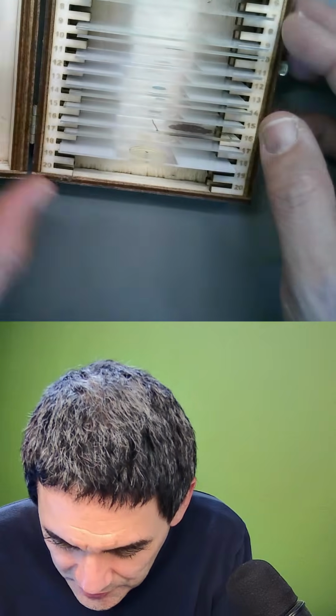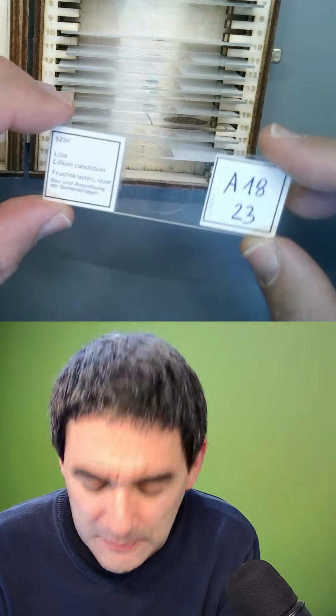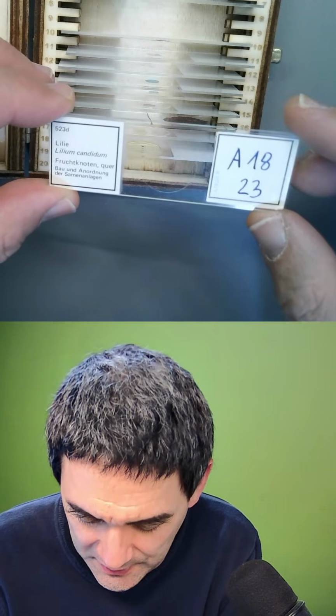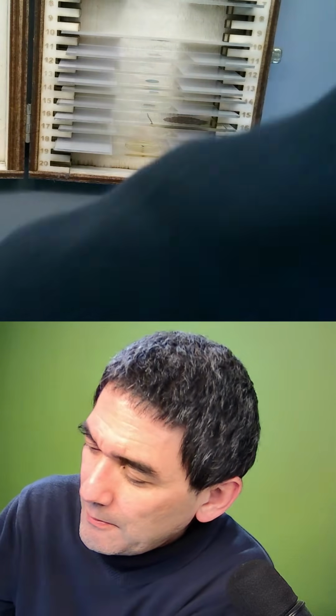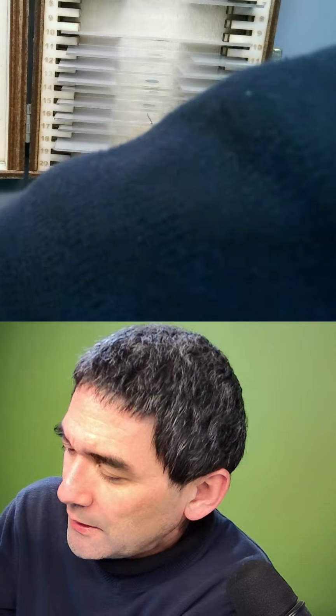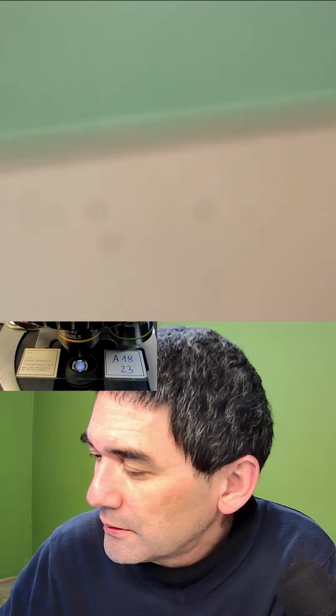So let's go on here a little bit. There are a few others. I think that's one of the things that I wanted to show you. That's the ovary of a lily, of a plant, and this is quite cool because let me show you. Where is it? I have to find it again.